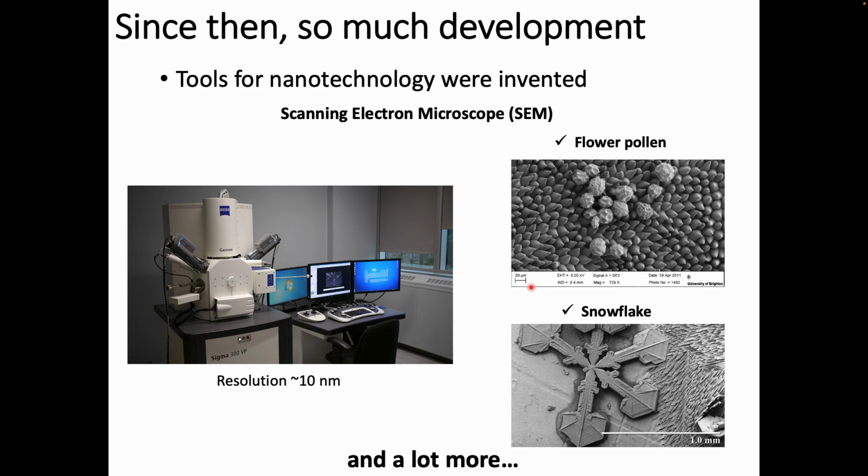So this one is actually a very powerful tool, and if you have used it before, you probably also know how easy it is to operate, right? You just have to be careful about hitting the sample on the beam. If you avoid that, it is fine.